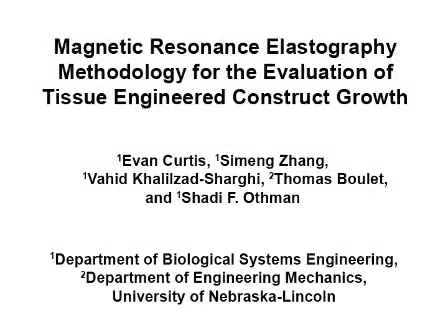To examine engineered tissue constructs, traditional mechanical testing, which often results in the destruction of the sample, is not acceptable. This method uses microscopic magnetic resonance elastography, or micro-MRE, as a non-invasive technique for measuring the mechanical properties of small soft tissues.